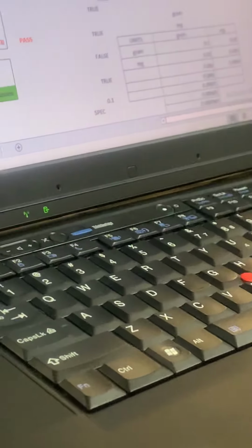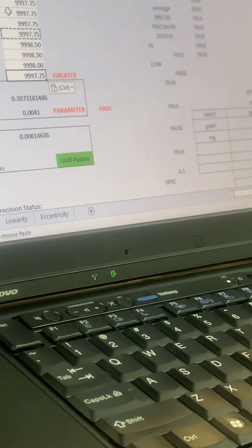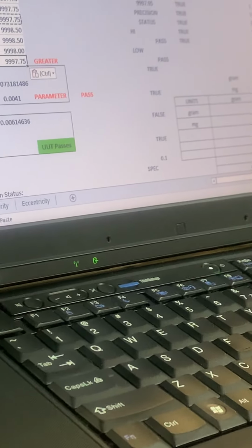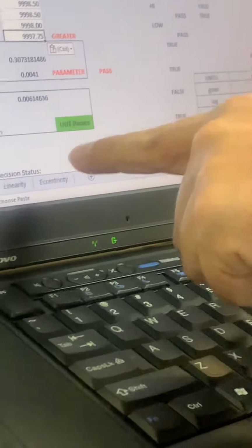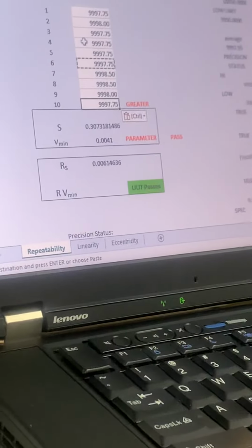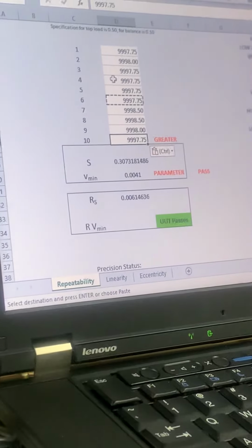It just determines that for the client. So if they want to know, they'll choose the repeatability, like test it at 1,000, 10,000, whatever, and you run it, and that's it. Just do this, multiply. Even in grams, same thing. And we know to multiply it by 2,000 because that's literally what the USP41 does. You can look it up online, and you take that number, you multiply it by 2,000.